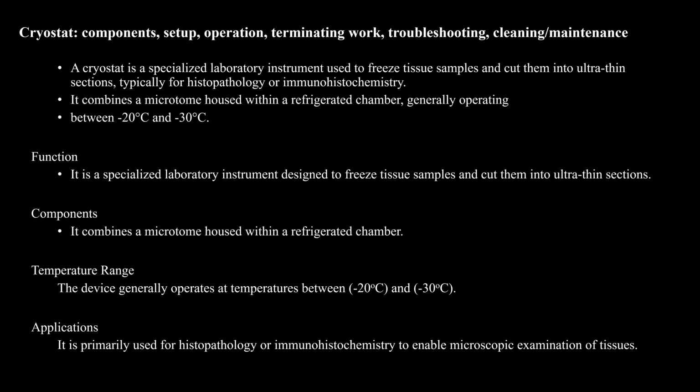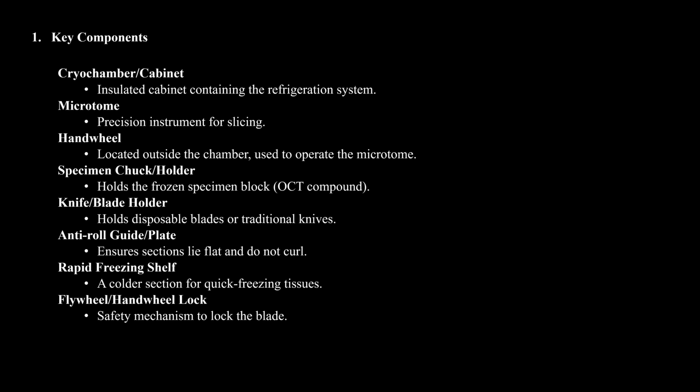The microtome is housed in a freezer chamber. General operation temperature between minus 20 degrees Celsius. Used for immunohistochemistry, enabling microscopy examination of tissue. Key components. Cryostat cabinet, the instrument contains the refrigeration system.